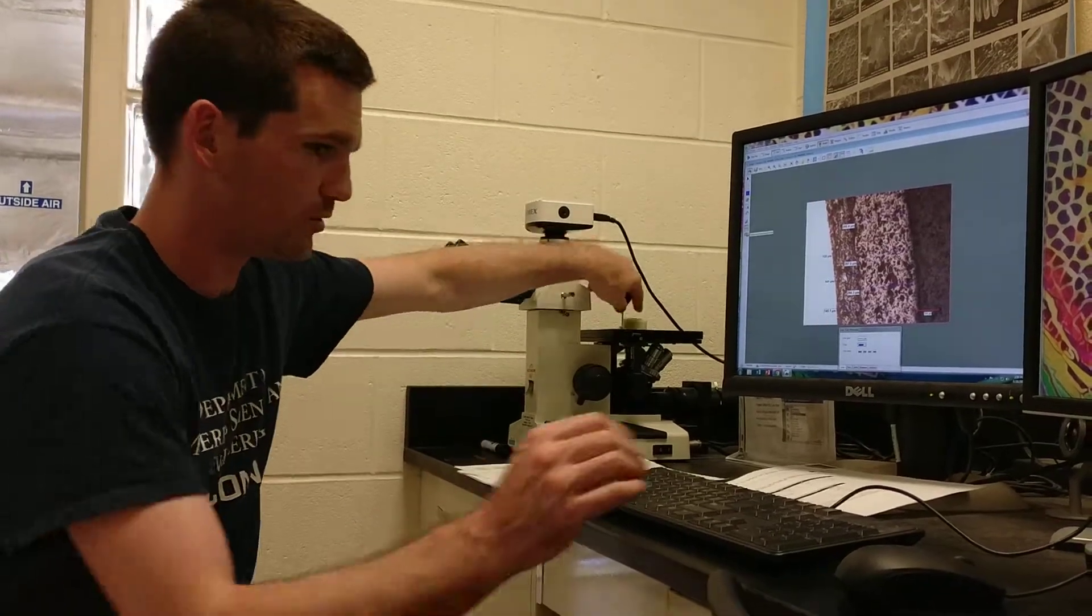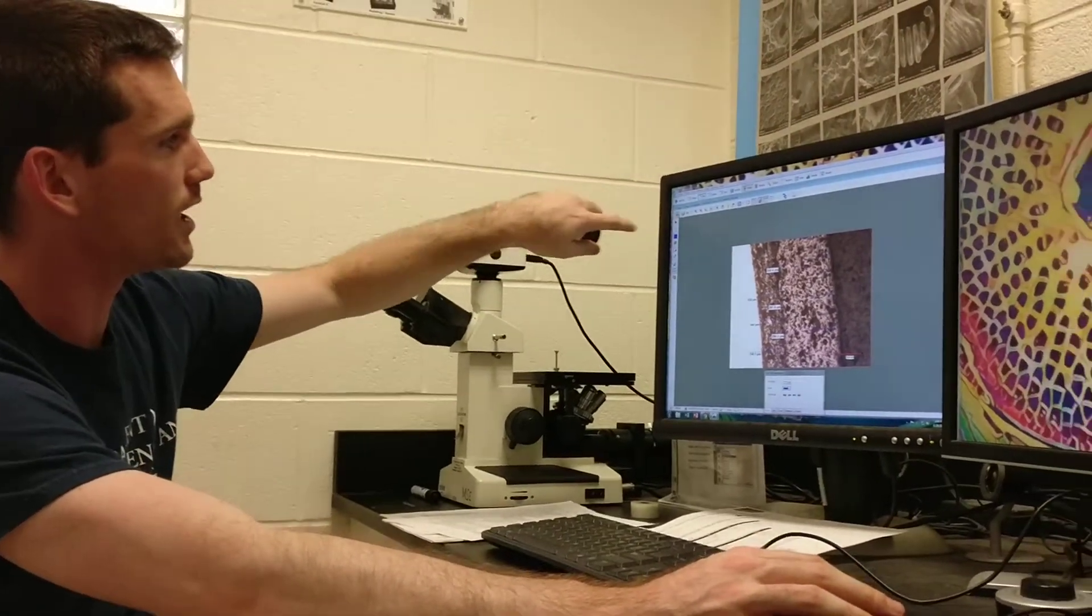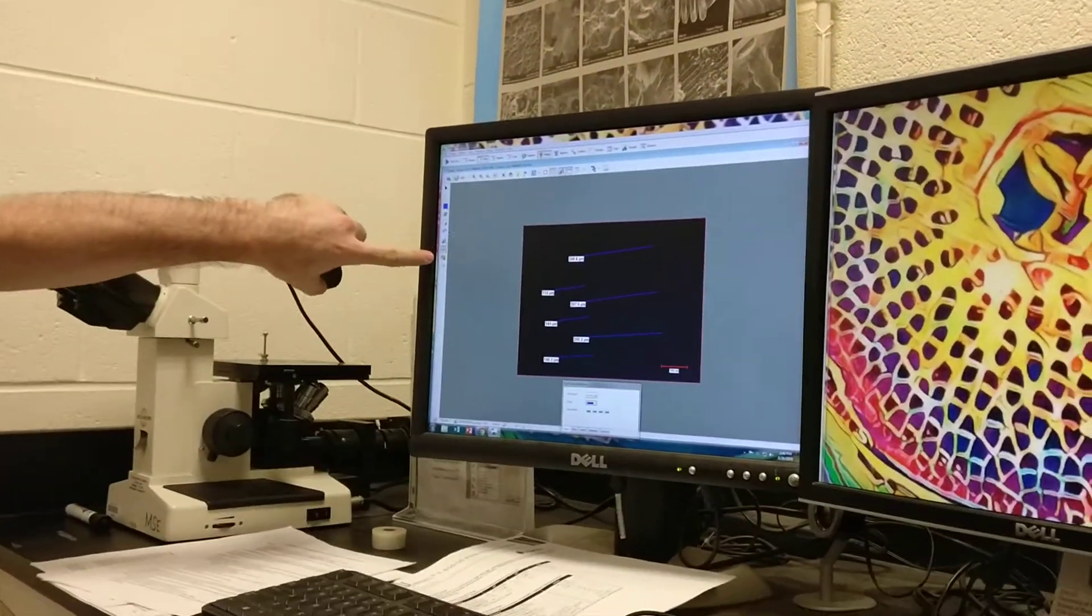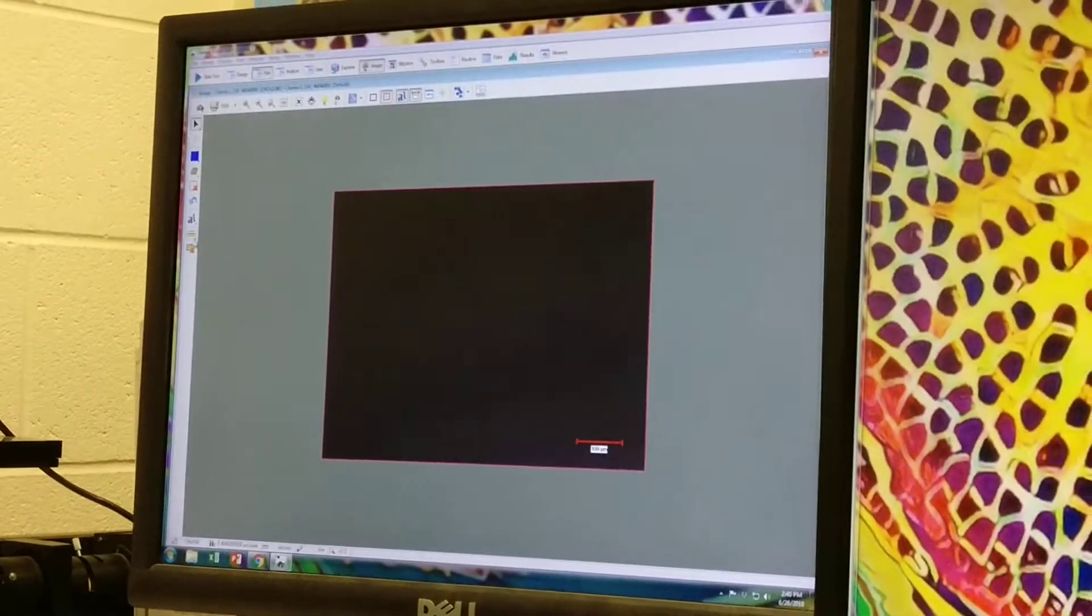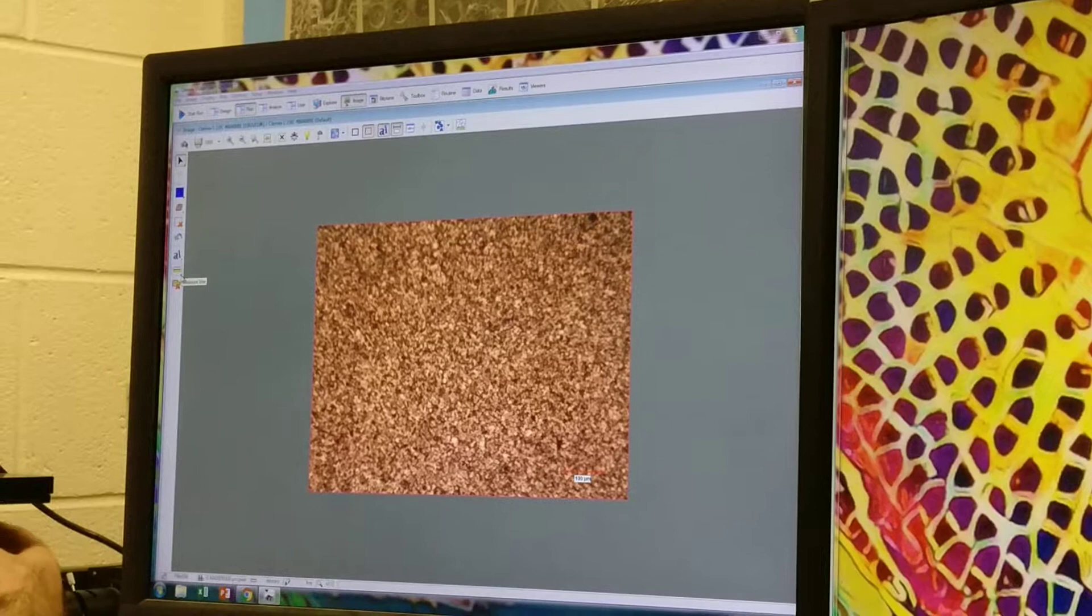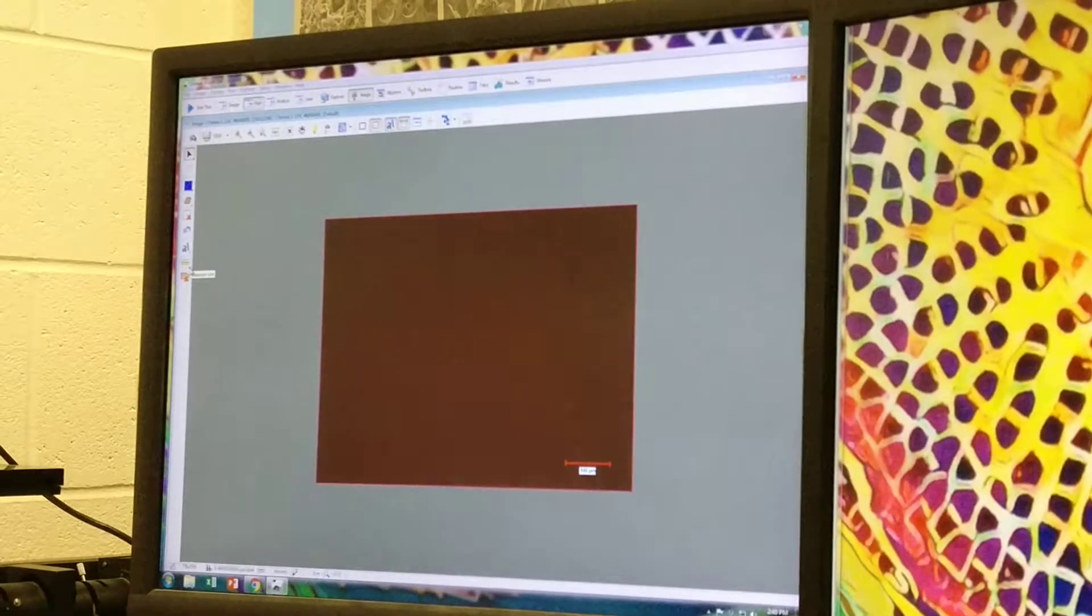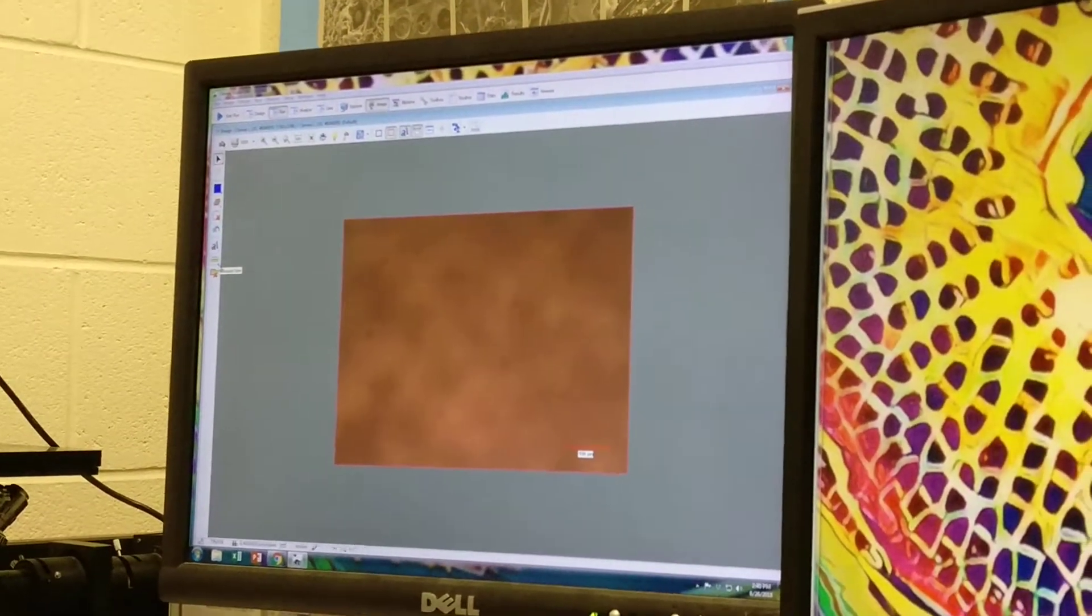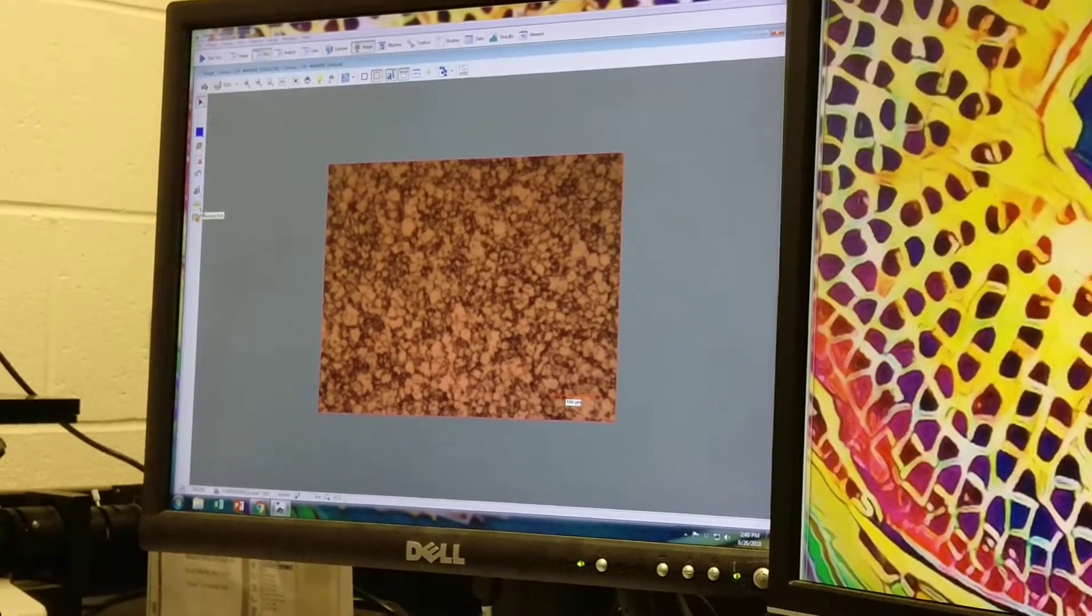For the last sample, to get the image to change on this screen we should click the camera icon again. We can click the bottom left icon here to delete all of our previous measurements. We're going to go up to the highest magnification on this superalloy to see all the grains, see all these tiny grains there.